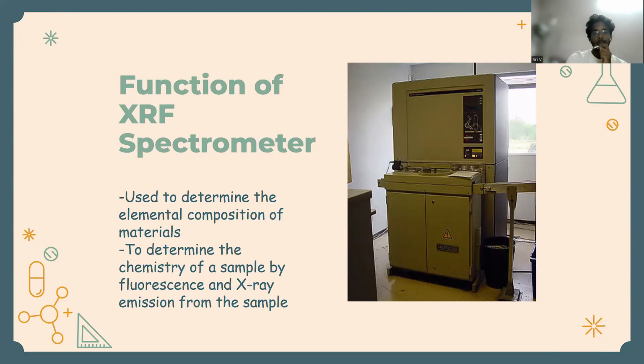XRF or X-ray fluorescence is a non-destructive analytical technique used to determine the elemental compositions of materials. XRF analyzers determine the chemistry of a sample by measuring the fluorescence or secondary X-ray emitted from a sample when it is excited by a primary X-ray source.